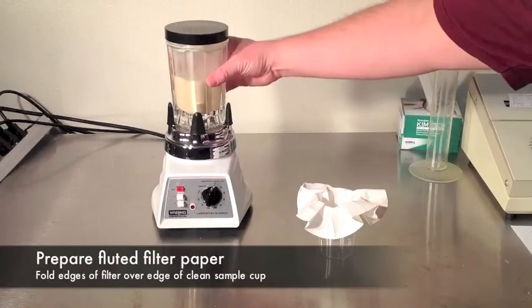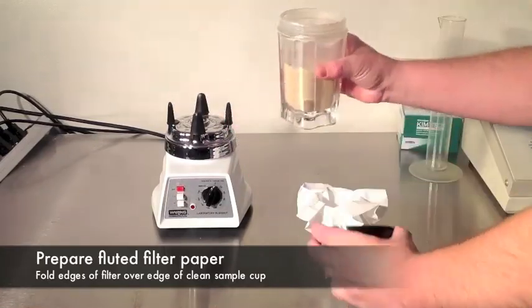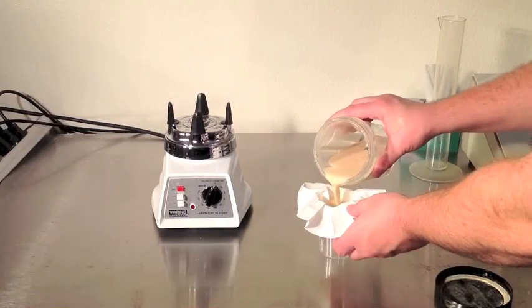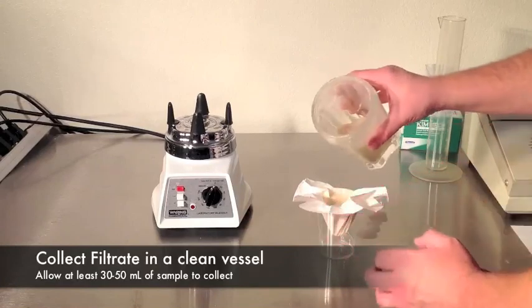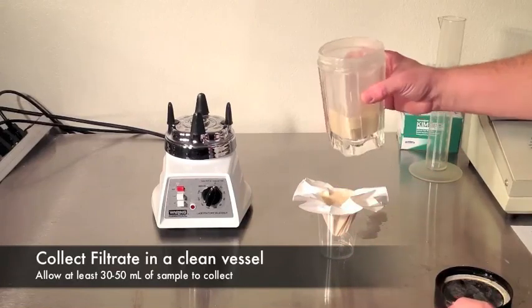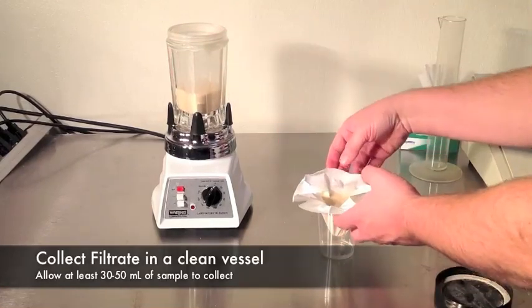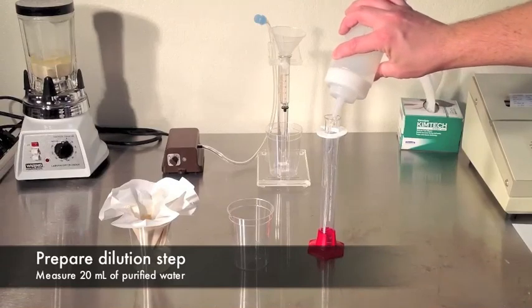While blending, prepare your fluted filter paper by placing it into a clean collection vessel. Pour your blended mixture into the filter and begin collecting the sample. While the sample filters, prepare for your next step of the procedure.